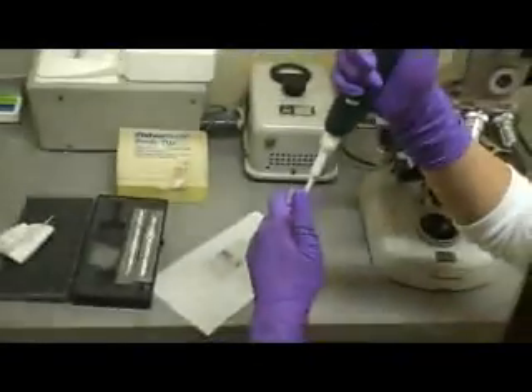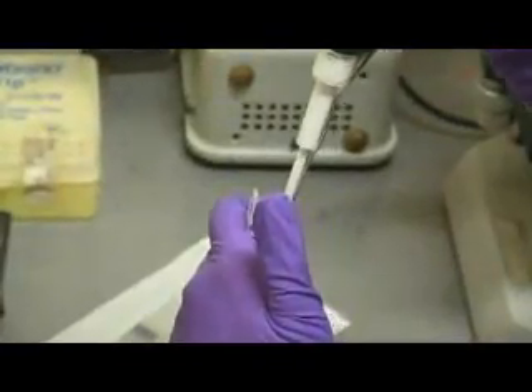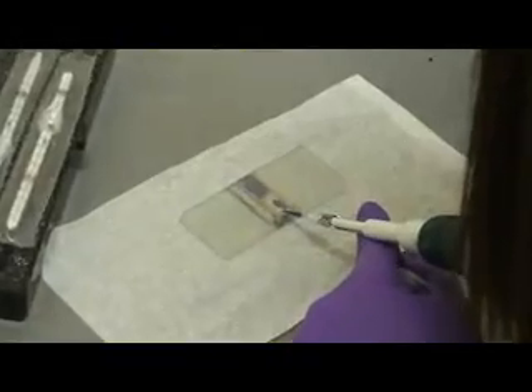Then switch to your other side. Again, pipe it up and down a couple of times, and then inject again slowly.